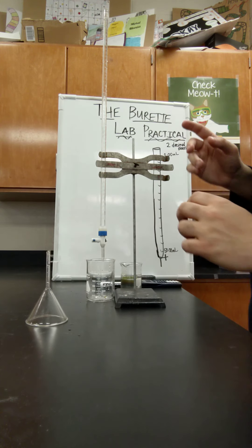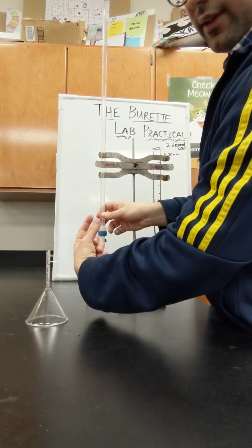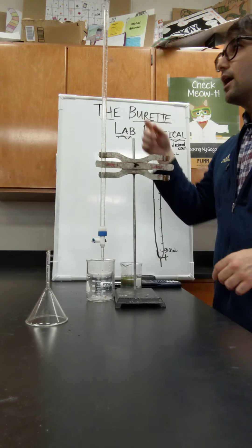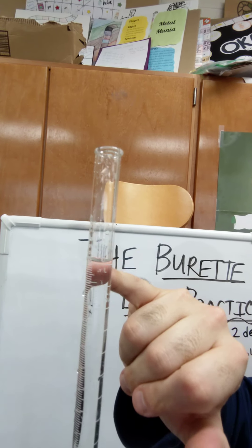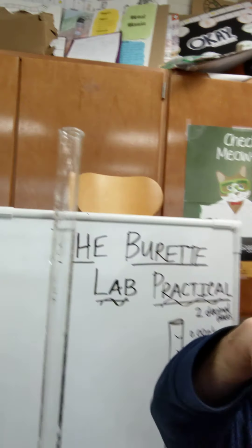I'm going to try to release it so it goes to about the zero mark. If you turn the stopcock upwards, I can release some of the liquid into the beaker. I'm going to get it to about the zero mark. Right now I have the liquid at approximately the zero mark. You've got to read the meniscus — when you read the curvature of the meniscus, the bottom of the curvature is the reading you make.